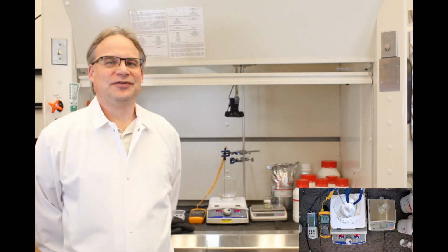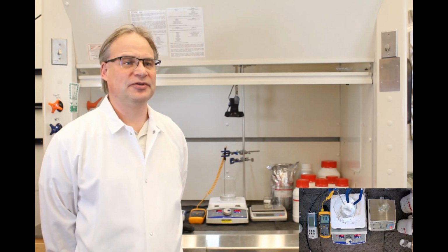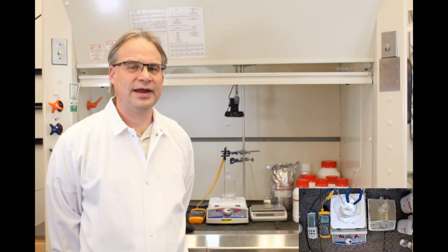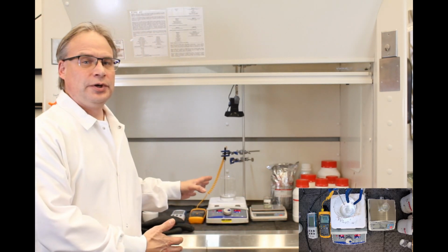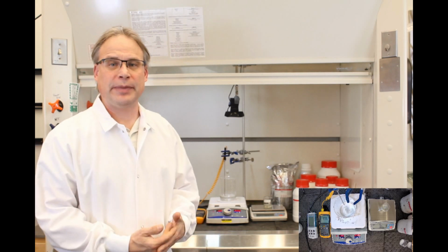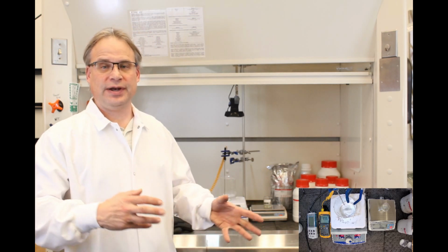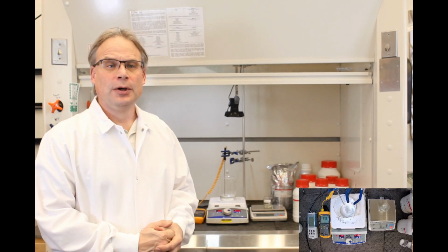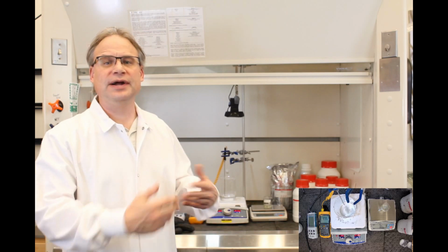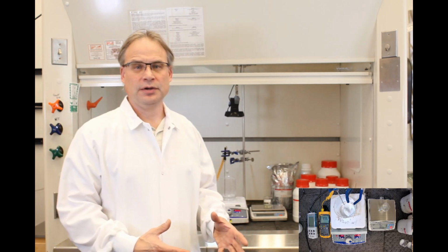We are a lab and production facility for various flavors, synthetic nicotine and salts. I also spend a lot of my personal time just analyzing and reverse engineering as many things as I can to determine how they all work. We have several labs like this with fume hoods. We have several analytical instruments. We have half a dozen mass spectrometers to identify molecules. We have HPLCs to purify, concentrate, and or even analyze them. We have atomic absorption spectrometers to determine metals in things. We have atomic emission detectors, FIDs, and all kinds of other instruments that help us identify every single molecule and compound we can in just about anything through a series of extractions or just neat injections.